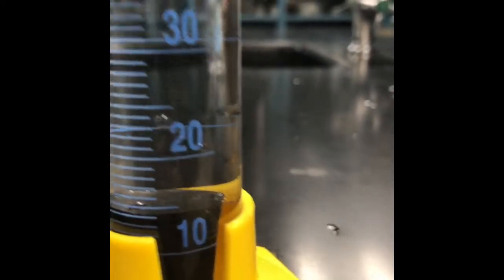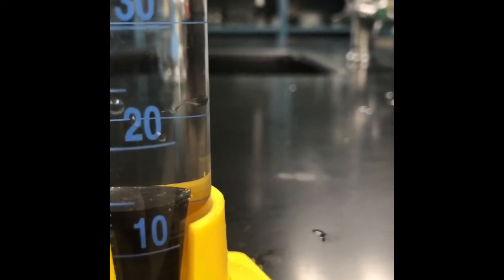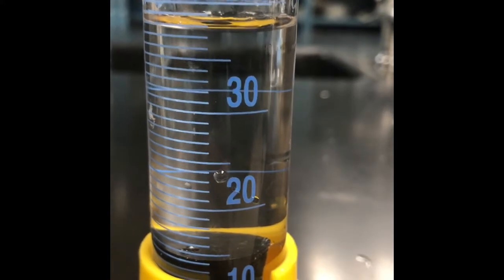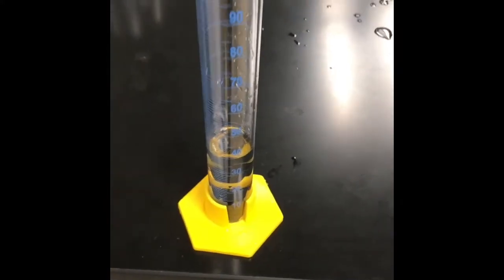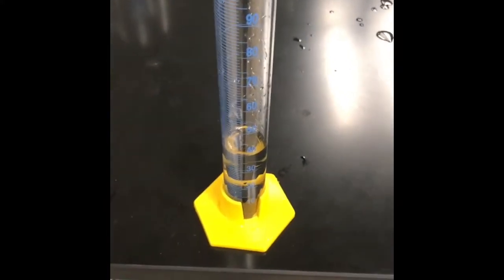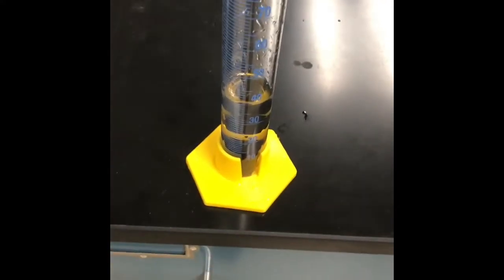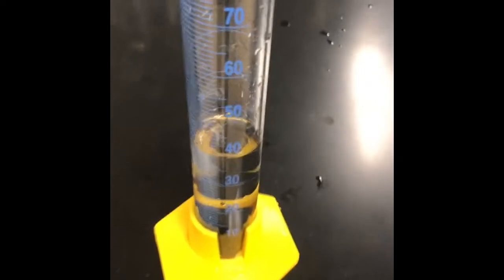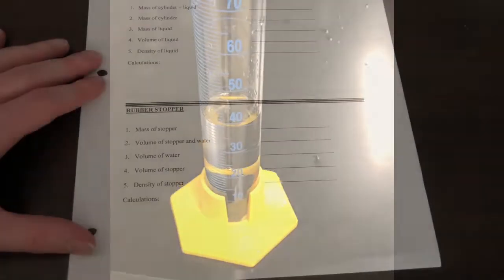Okay, it looks like it went up to about 38 milliliters. Once you've calculated the mass, which we got from the scale, and the volume that the stopper has by water displacement, you can calculate the density.